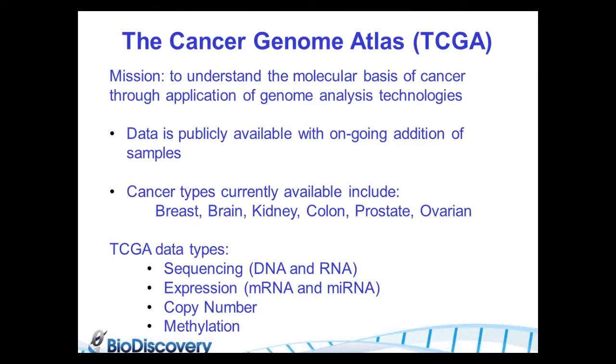Already jumped ahead. All right, we're going right in. I'm going to be talking to you today about the Cancer Genome Atlas and Nexus version 7.0.